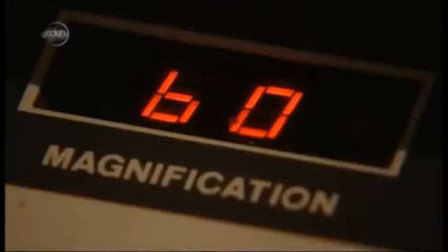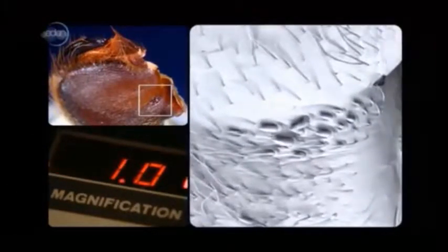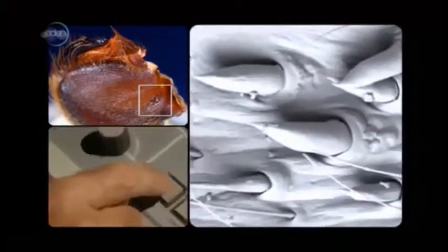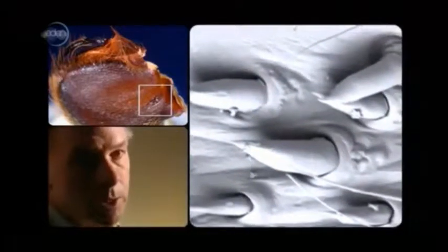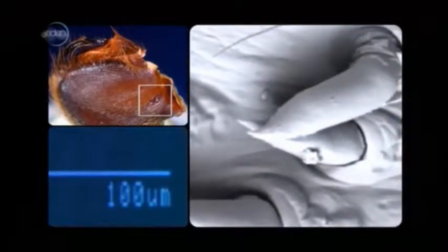On these spines on the front face of the chelicerae, in a normal light microscope situation, we would see these big black things and we couldn't do any more. And significantly, they are not the same sculpturing as the adjacent hairs. They're very short, strong spines, and they've all got this short, hook-like tip, which is very unusual.